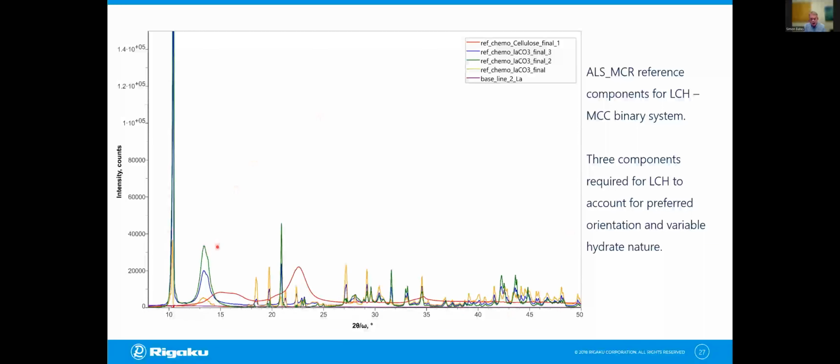The lanthanum carbonate octahydrate has many components. So we picked out 3 of them. As you can see, there is a huge variability in the signal from the lanthanum carbonate. It's just astonishing. You know, this broad peak cluster here, you can see how the intensity changes here. The very sharp low angle peaks, in one sample, it came all the way down here. So there's a massive variation in intensity. And even the appearance of the patterns are quite different. So clearly, this is going to be a complex problem for us to try and resolve.